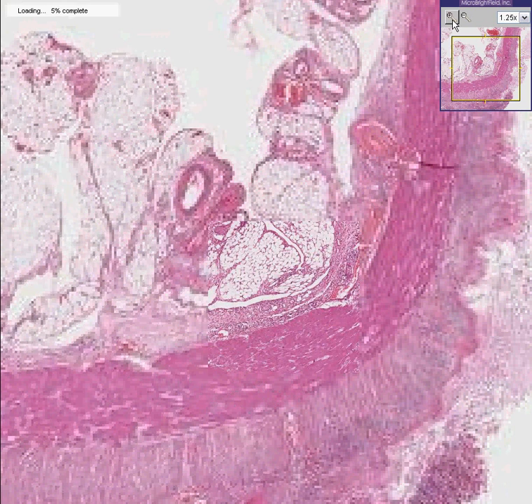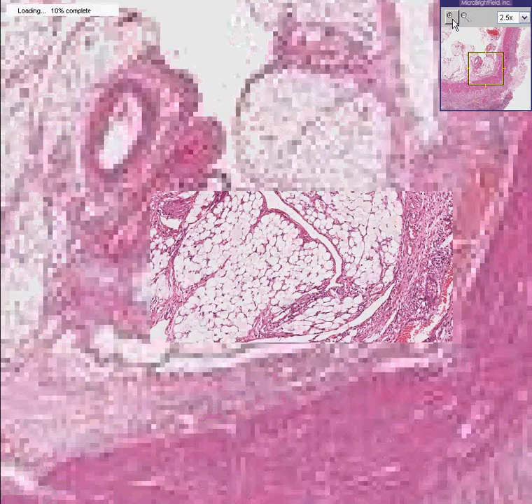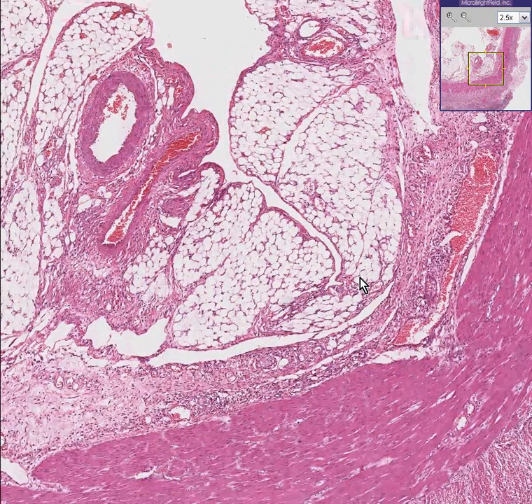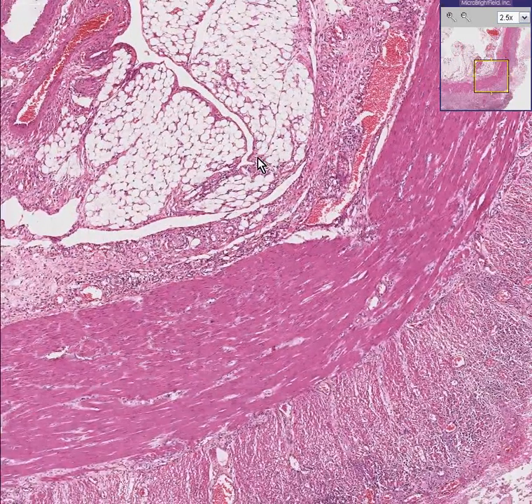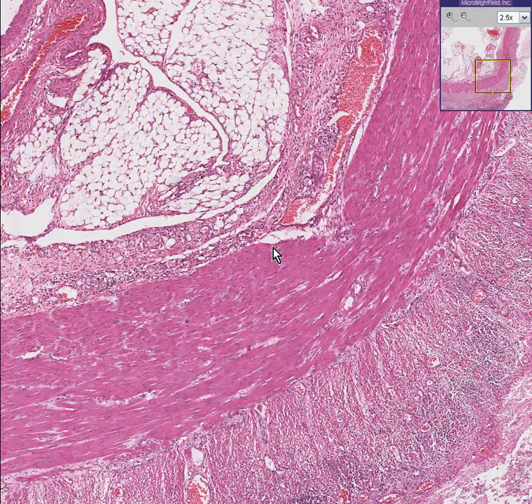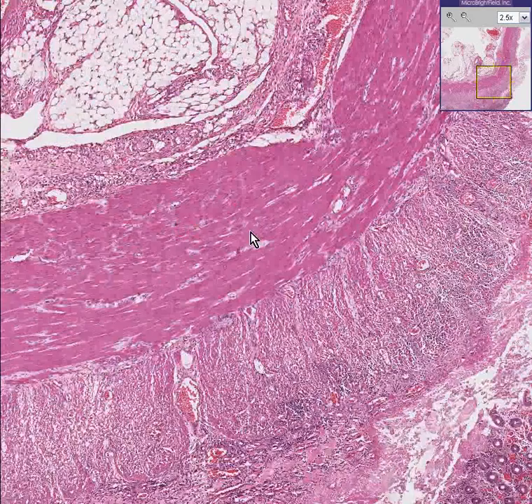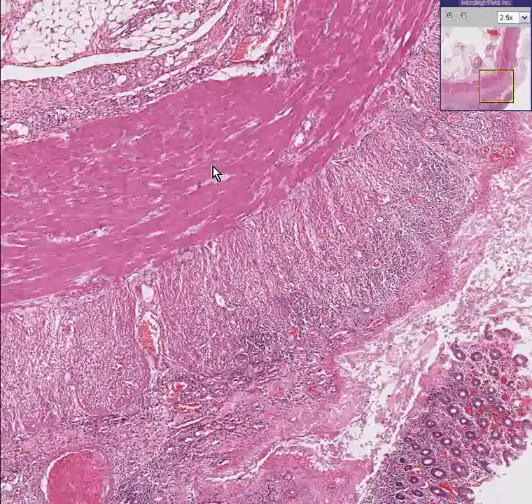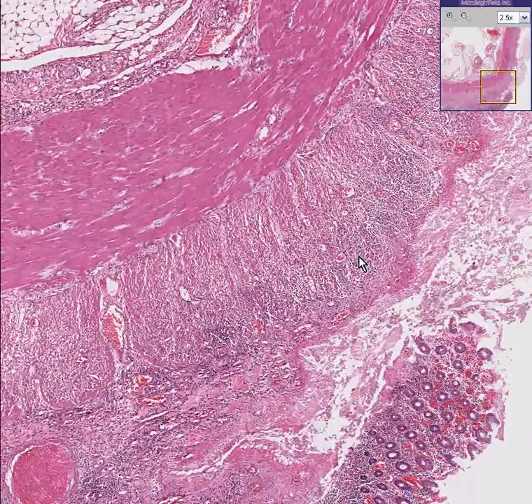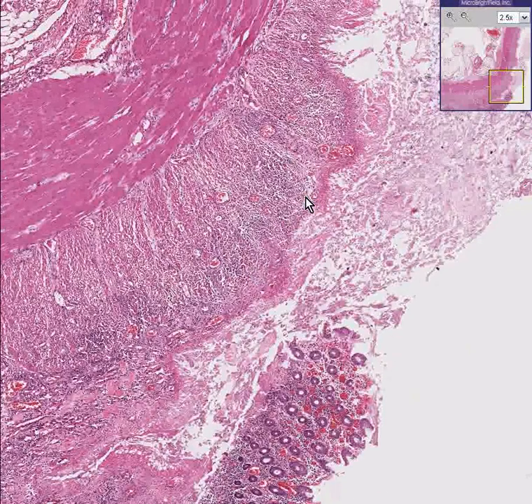Let's look around a little bit. The first thing we notice is that there are even some inflammatory cells scattered out here in the adventitia or serosa. The muscle appears nice, smooth, and uniform. The submucosa here is totally infiltrated by inflammatory cells.